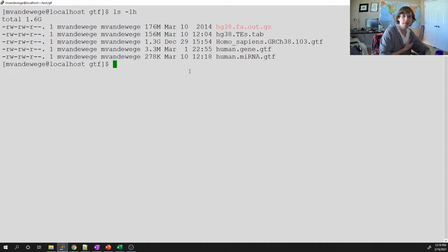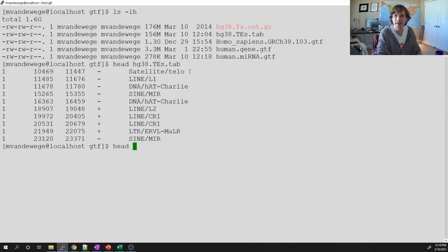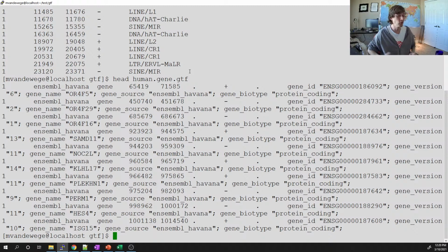Anyways, one thing we can do, this is kind of interesting: I don't think in undergrad biology we really take advantage of or appreciate transposable elements. They definitely get overlooked pretty frequently. But we're going to use information from two very different files. So we have the TE file and our GTF. For now, for like 2 seconds, I'm just going to play with the protein coding, the genic information, so the human gene GTF. Okay, so we have the two different files.